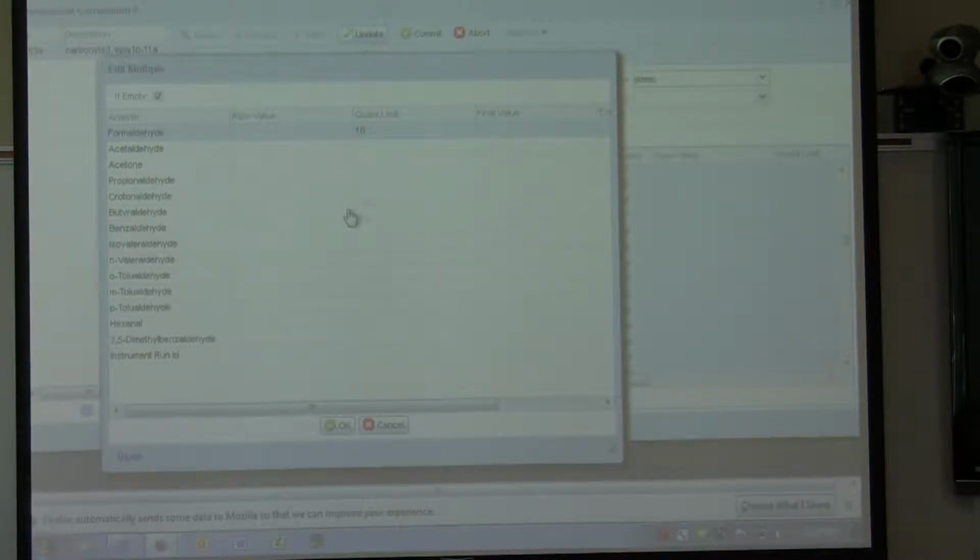And then can you copy 10 and paste 10 all the way down? She's talking about highlight one, Control C, and then Control V. Okay. Jerry says no.